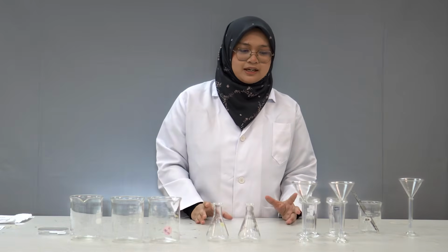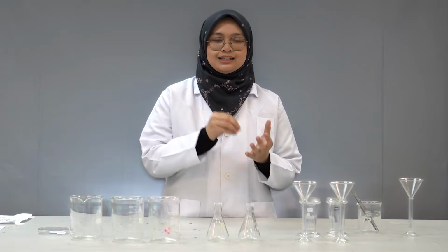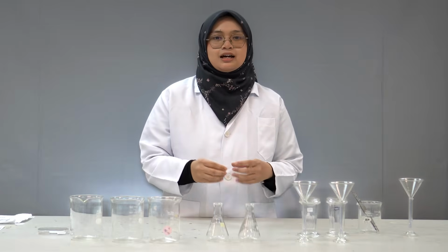Next we move on to the part during the experiment. For the TLC experiment, we use acid and base, and we know that acid and base are very harmful. So we have to handle all the chemicals carefully and gently.